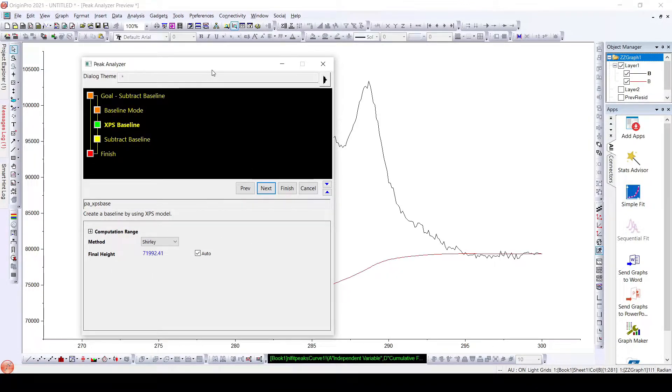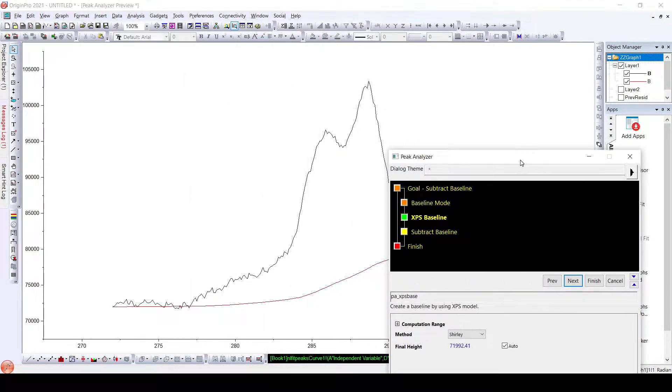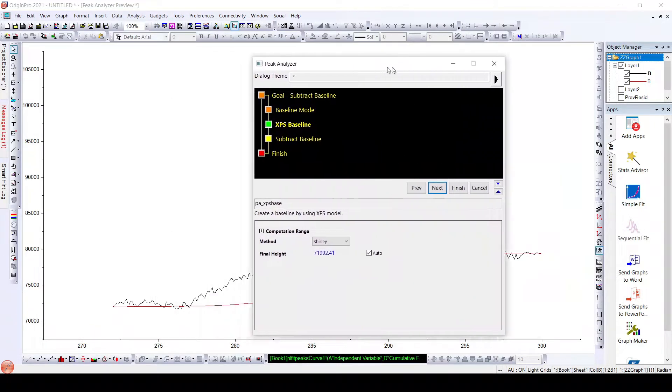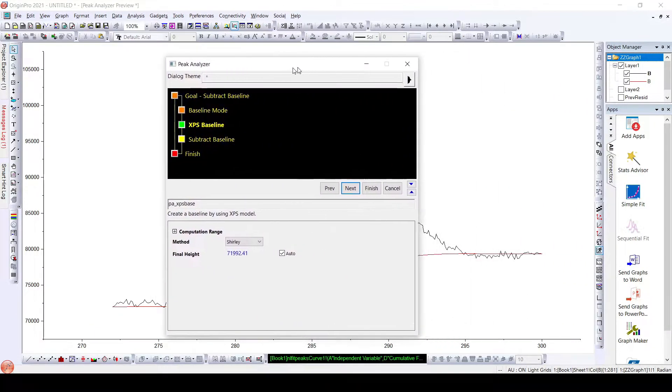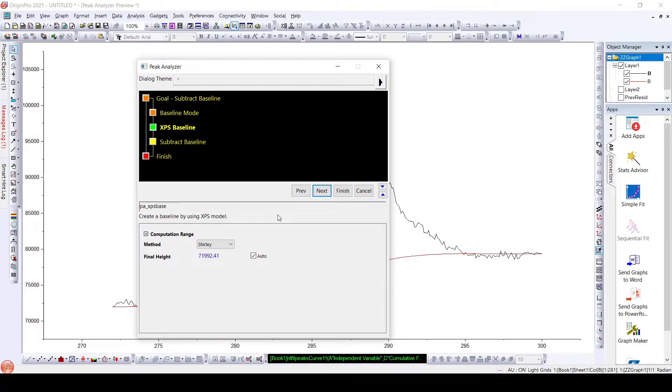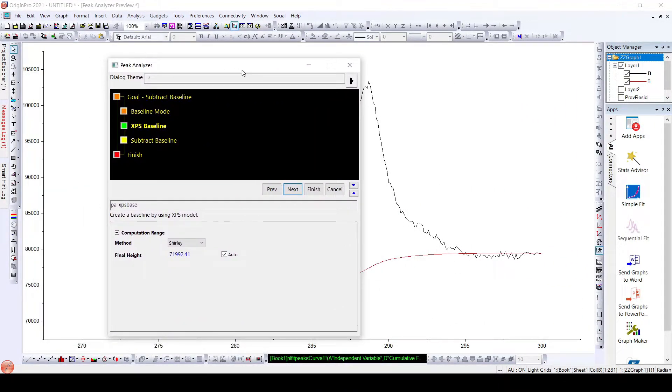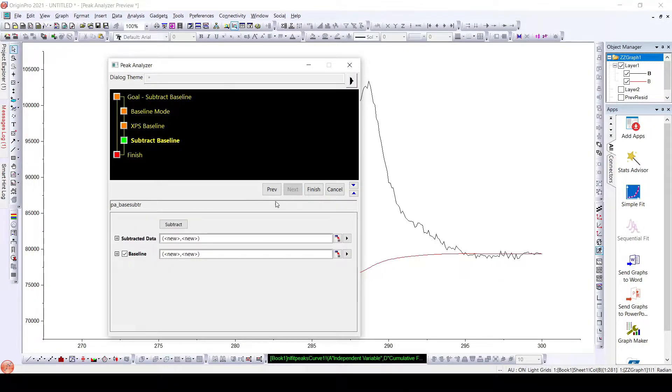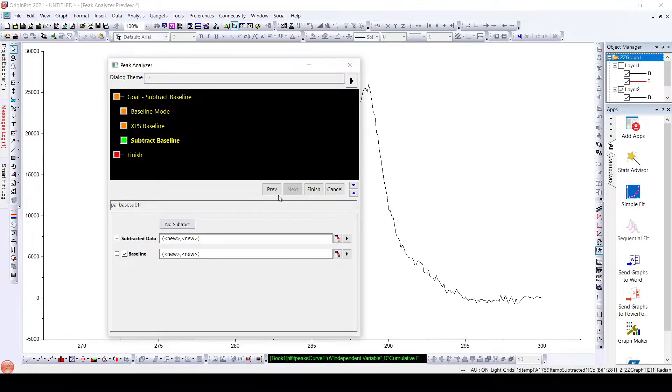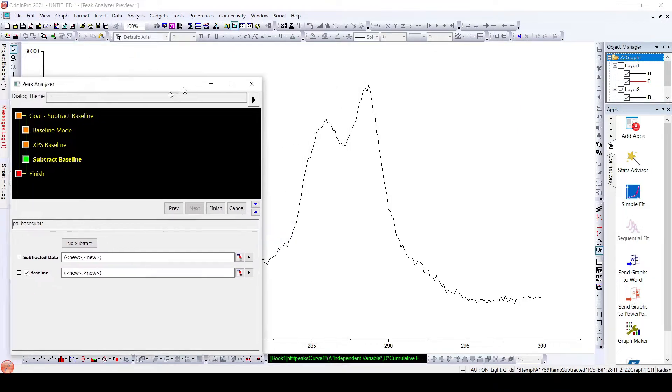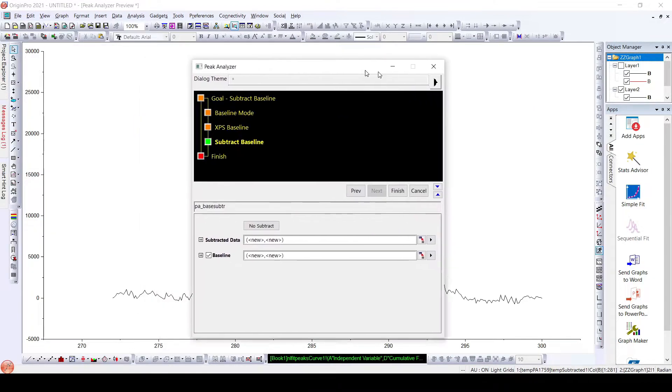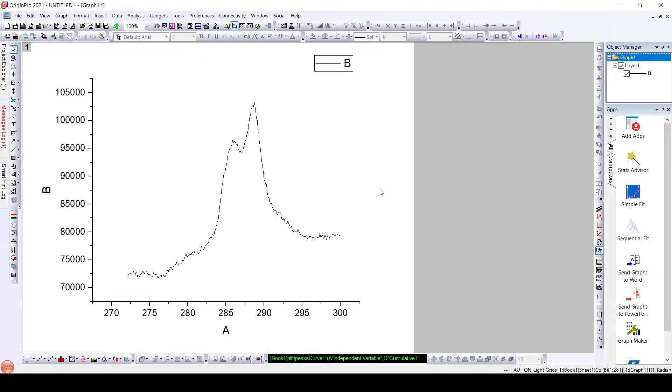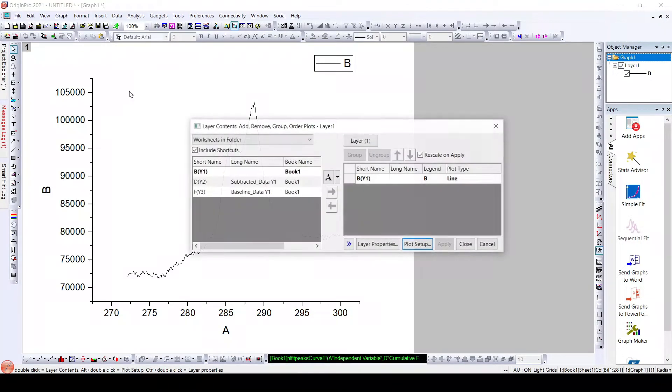Here we can see the baseline is well fitted and as expected. We will click next, subtract this baseline. Here is our subtracted data. Now finish. We will replace this data with the subtracted data.